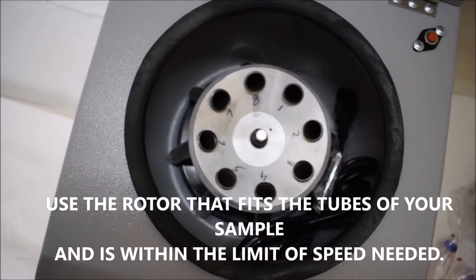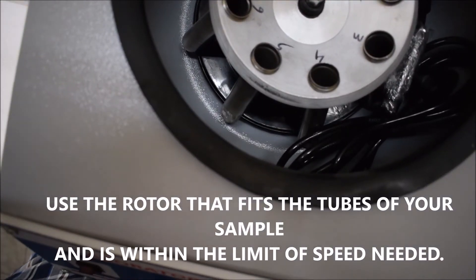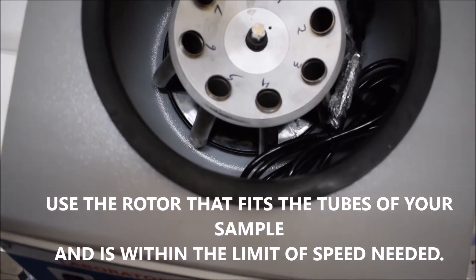Choose the proper rotor to use at the speed you need. Use a rotor that fits the tubes of your sample and is within the limit of speed needed.